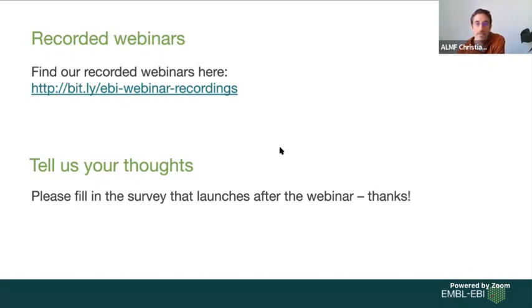Then Victor, what is the most versatile image format? By versatile, I mean the format that tends to be supported by most machine learning methods. Yeah, if I would know the answer, that's why I was saying we should really find a solution there. That's why I'm very much active with this OME-Zarr, because I hope that we will finally have a format that will answer your question. I think for now, the best standard might be OME-TIFF. So I would say that's maybe my answer.